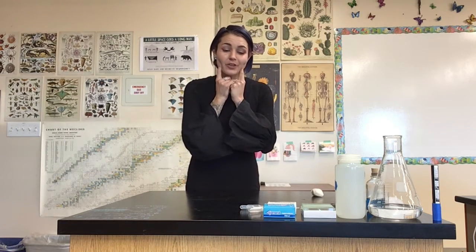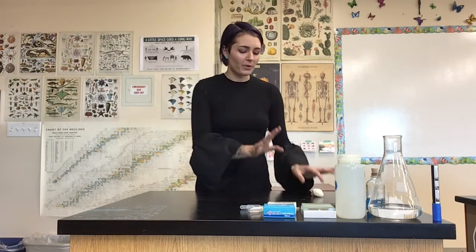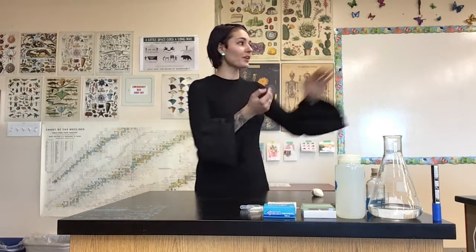Guys, and welcome to another virtual lab. Today we are actually going to be making slides with garlic cells and cheek cells. So I'm going to take us through everything. I'm going to show us how we isolate the cells from the garlic as well as from our cheeks. We're going to stain them and then look at them underneath the microscope. So without further ado, let's go ahead and get started.